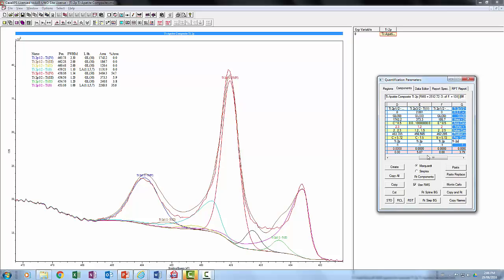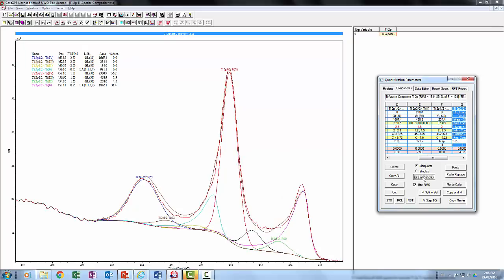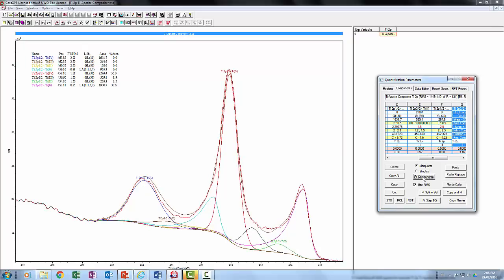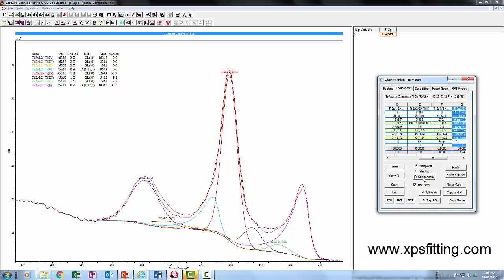If we hit fit a couple of times, we're now starting to get a pretty good fit of this entire spectrum. You can see we've quantified all the different species, and that's that for titanium.